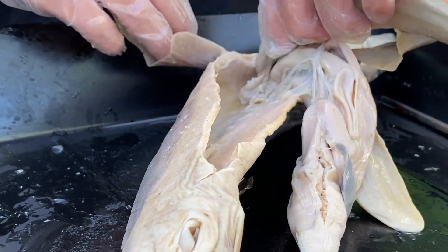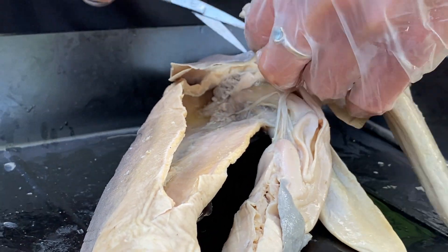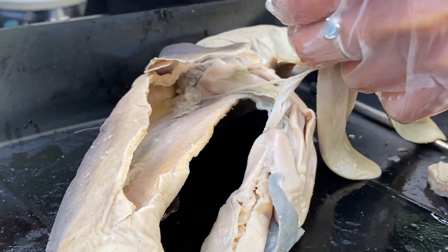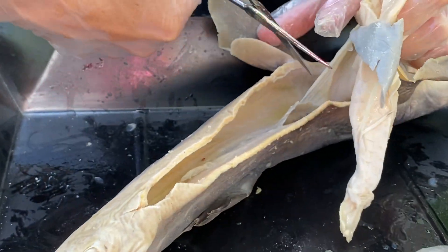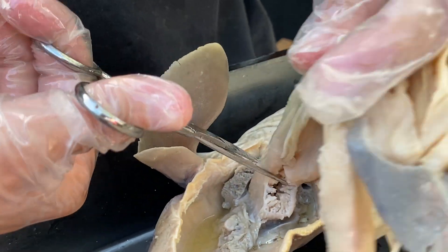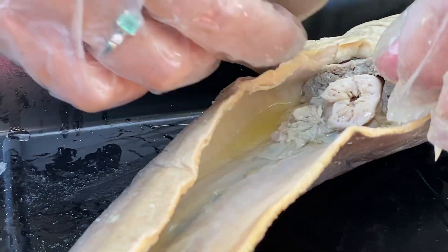I want to be careful — I can't just rip it out up here — because there are some structures that are underneath the liver and the esophagus that I do not want to cut out that have to do with the reproductive system. But because this is a juvenile shark, the reproductive organs are not very well developed at all. So we have removed the digestive system from the shark.